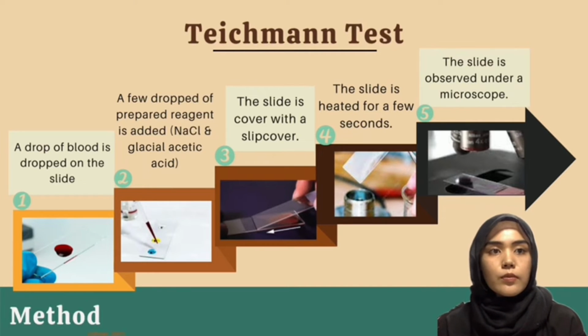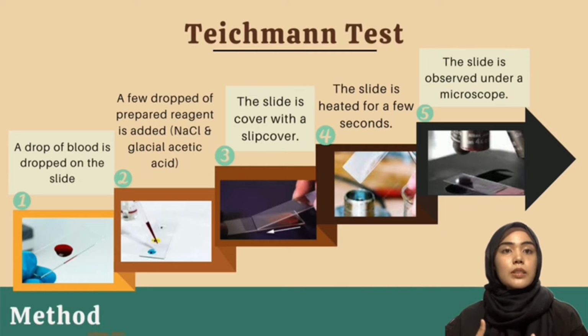Thirdly, the slide is covered with a cover slip, and then the slide is heated for a few seconds until the first bubble is formed. Lastly, the slide is observed under a microscope.